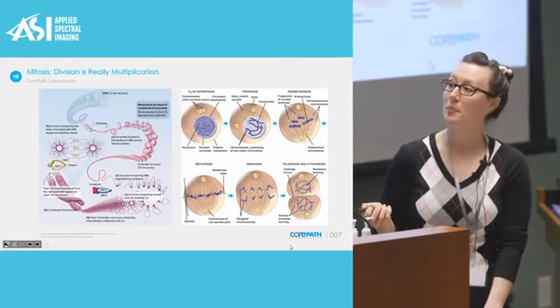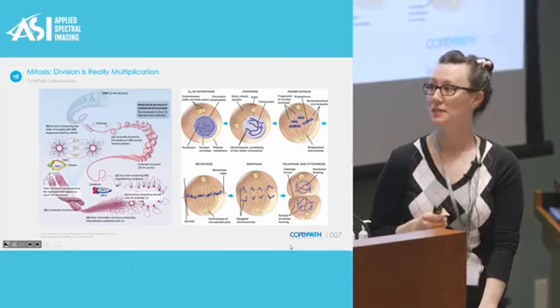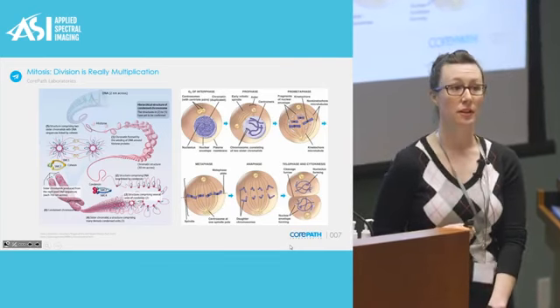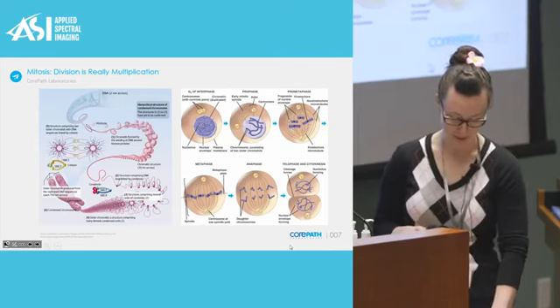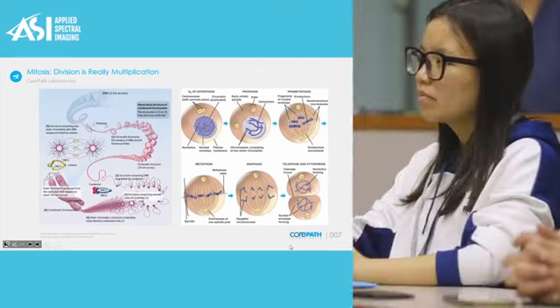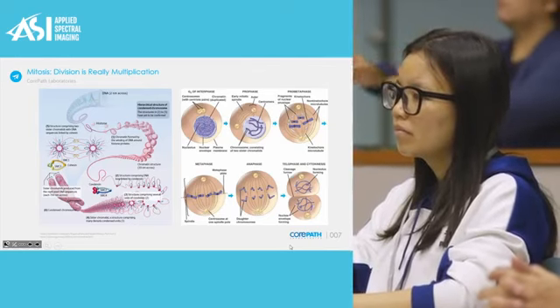Now this is where we're going to stop for cytogenetics. We're going to stop ourselves at the metaphase stage, and then we're going to dive in and do some other fun things. We're going to see what is needed to visualize these beautiful chromosomes and how we're going to use them.